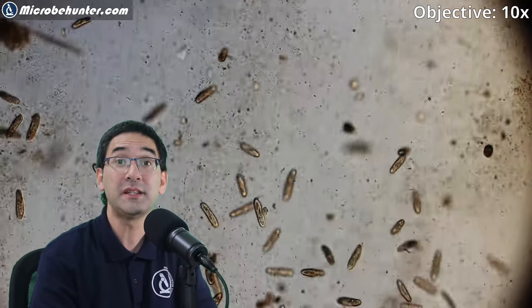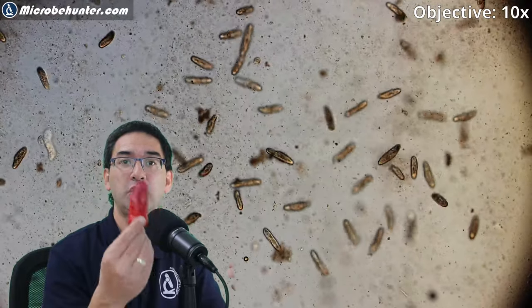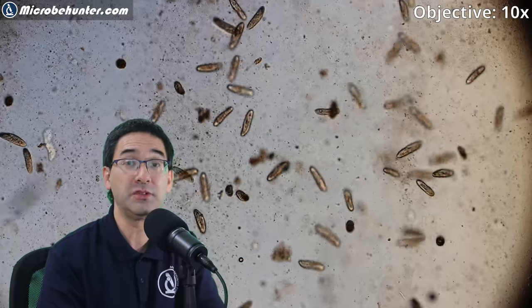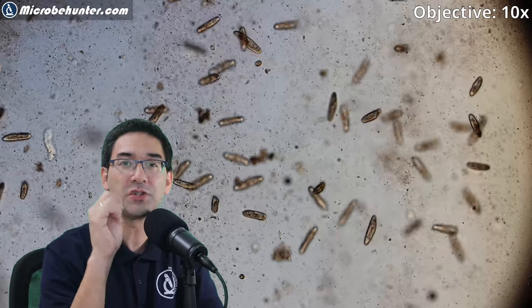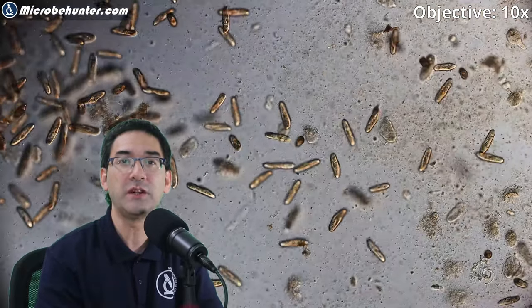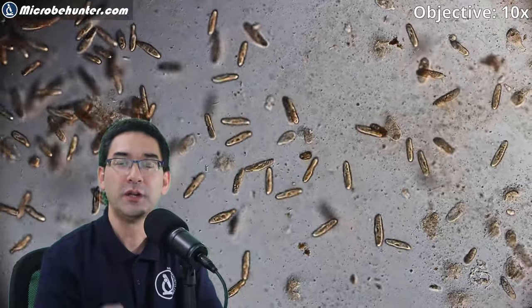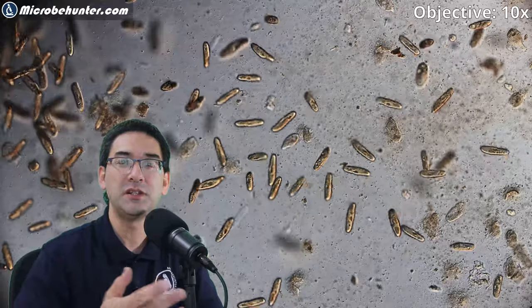You can see many of them spinning around and ultimately dying — sometimes spinning along one axis, in other cases along the other axis, so it's kind of completely out of control. That's something I'd actually like to study further, not using a chili like this but a pure capsaicin powder or substance. I'd have to dissolve it in a little bit of oil since capsaicin is not very well soluble in water. Here you can see them rotating in the other direction.